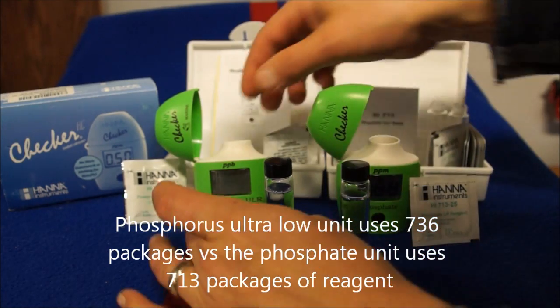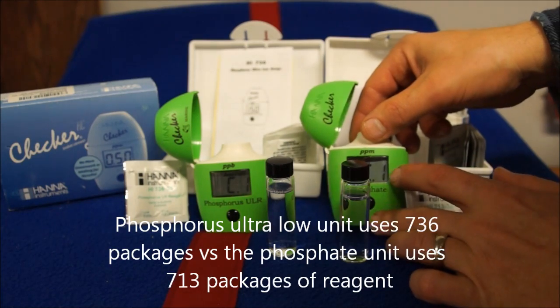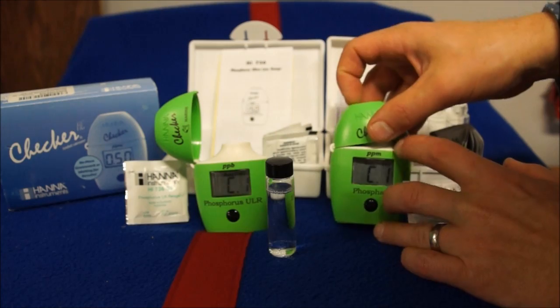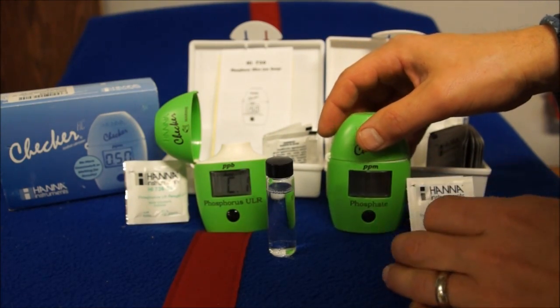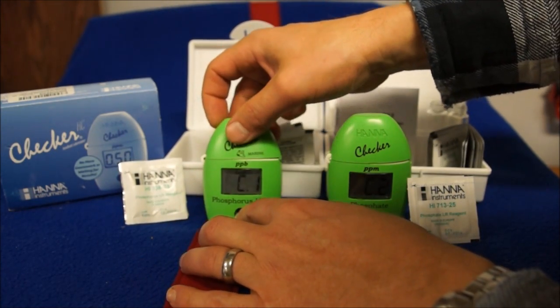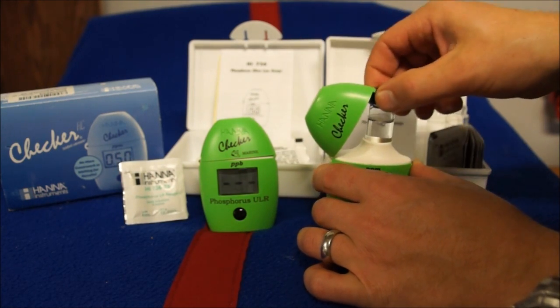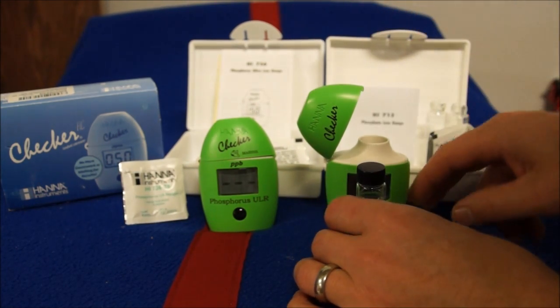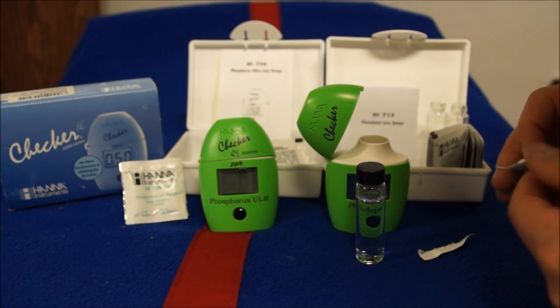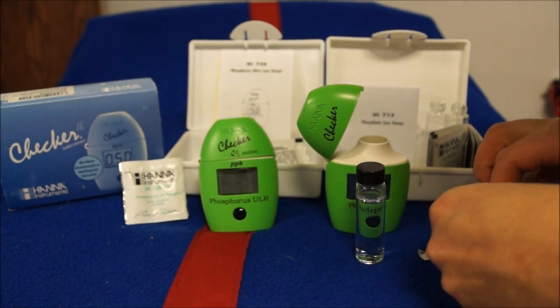They're each designed for their respective machine. At the beginning you calibrate it with your saltwater — push the button, it says C1, then put your saltwater in the little device and push it again. Since these samples are from the same tank they'll calibrate quickly. Then it says add C2, but before you add C2 you have to open the reagent packet, pour it in, shake it up for two minutes, and we're going to do that for each one.